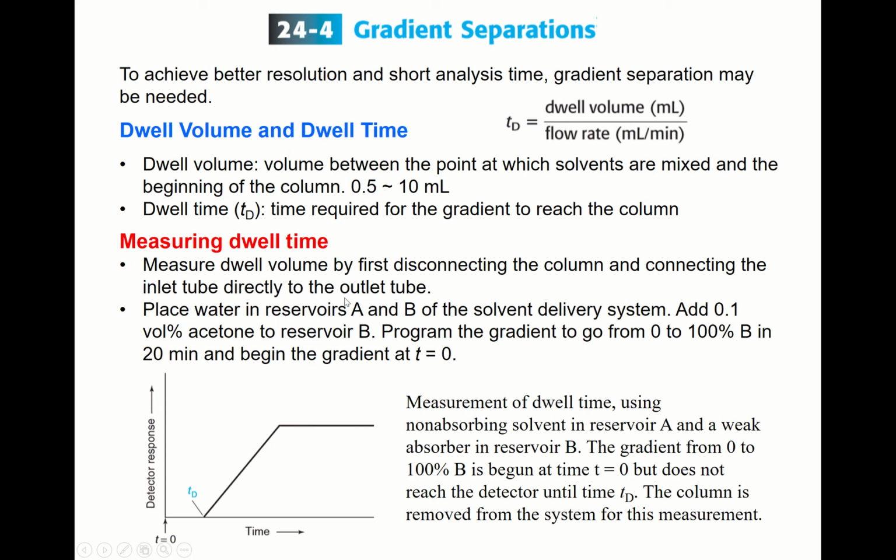How do you measure dwell time? It's rather simple. You simply disconnect the column and directly connect your inlet tube to the outlet tube.